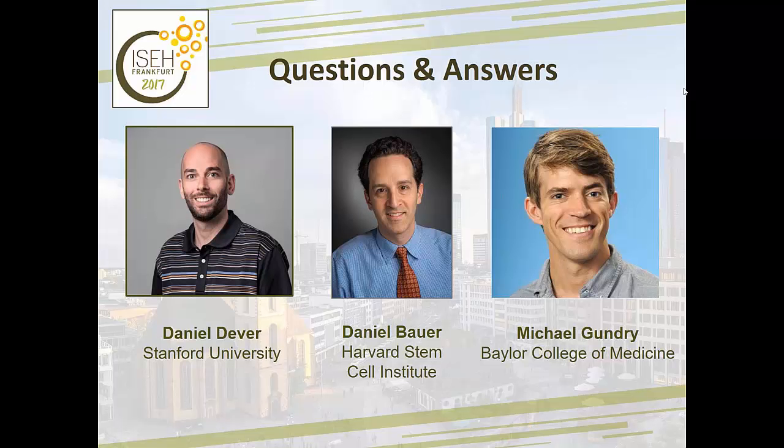I just had two things. One thing is, the audience out there is taking our word for it. But if you have any questions, I would say just do it. If you want to compare AAV6 versus ssODNs, I would compare them side by side and with your own hands, who you trust, and see if you get the same results. If you want to try an approach to increase hemoglobin, like Dan Bauer was saying, try that approach versus other approaches, head-to-head. In my experience, that is always the best way to go. Then you just follow the data.